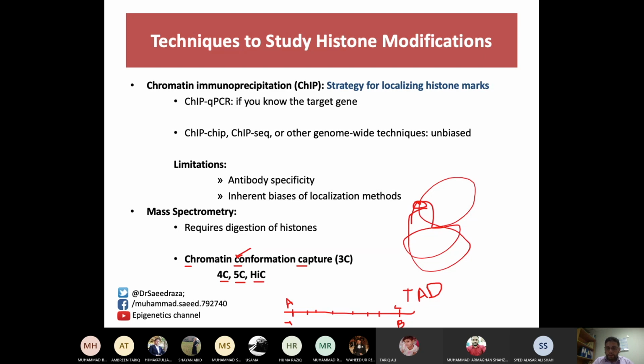Even if they are present on a single chromosome, or on a single DNA strand, the distance between them is millions of bases. A normal PCR reaction may not amplify more than, for example, 10 kb in size. So normally it is not possible to amplify more than 10 kilobases with a normal PCR.